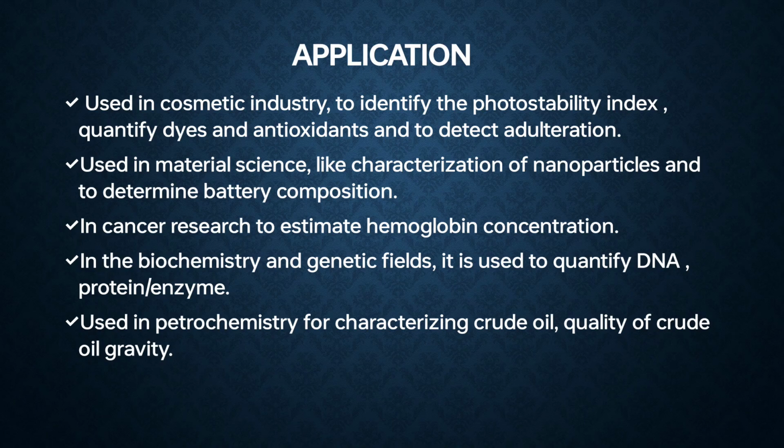This can also be used in material science for the characterization of nanoparticles and to determine battery composition. It is used in cancer research to estimate hemoglobin concentration. Also used in biochemistry and the genetic field to quantify DNA, protein or enzymes. Also used in petrochemistry for characterizing crude oil and the quality of crude oil gravity.